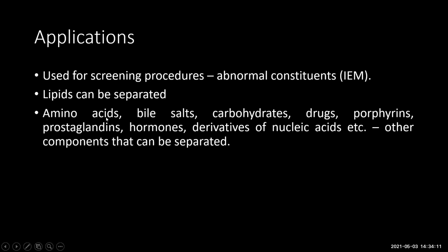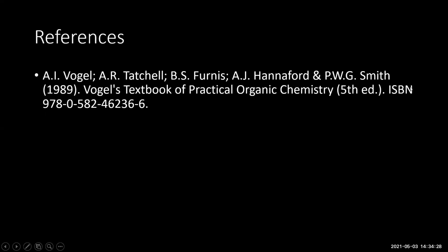Clinically, it is used for screening procedures to identify certain abnormal constituents, inborn errors of metabolism, and different amino acids in the urine sample. Lipids can also be separated. Amino acids, bile salts, carbohydrates, drugs, porphyrins, prostaglandins, hormones, derivatives of nucleic acids, and other components can be separated. So why is it versatile? Because almost all molecules can be separated using this technique. These are the references from where I have taken the details.